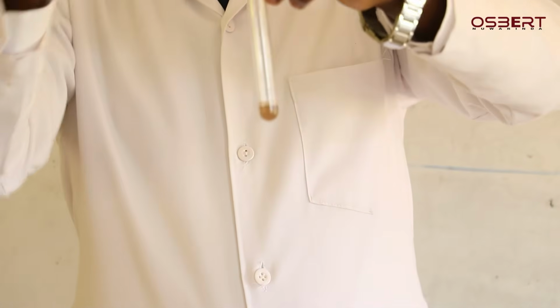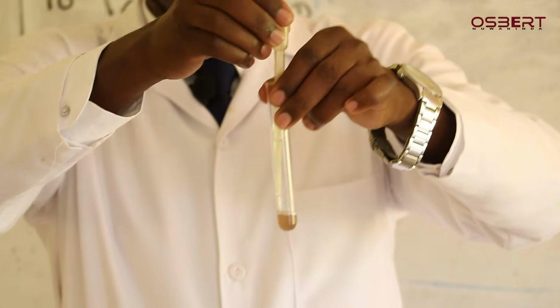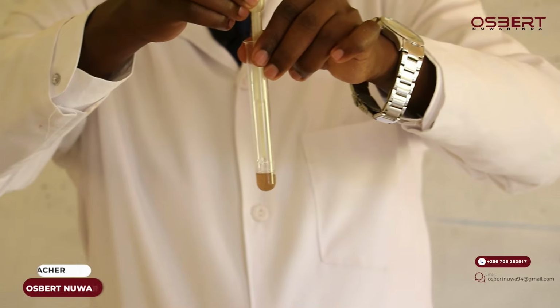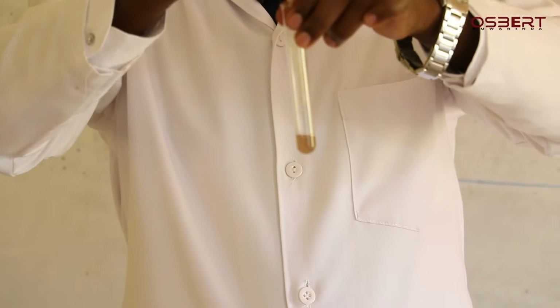23. Yeah, so I am supposed to add until this thing turns into colorless. So far it is 21 drops. When I look at this, 21, 22, so when you check here, those are 22 drops, then 23, 24, 25, 26, yeah, 26, you can add 27, 28.